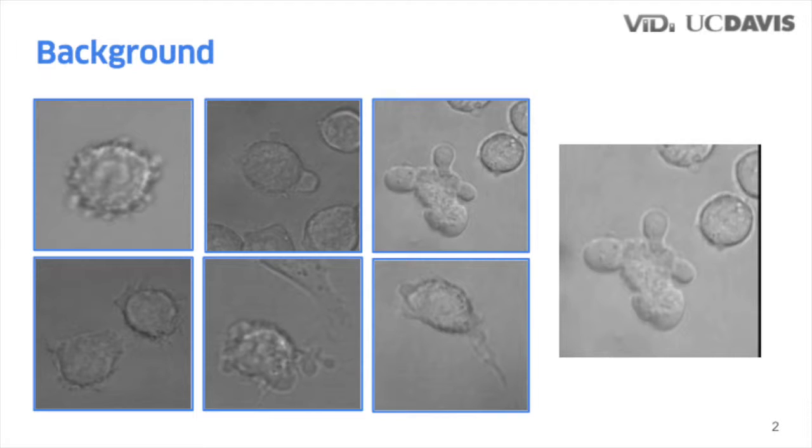On the right side is a subregion of an example video. It shows the very beginning of an experiment recorded right after a stimulus to the cell. It's 30 times accelerated. Experiments like these can last for hours. For comparative studies, it's difficult for scientists to look over cell features individually and then mentally correlate them. Information visualization can become helpful by visually summarizing the multidimensional information for all the videos in a study.